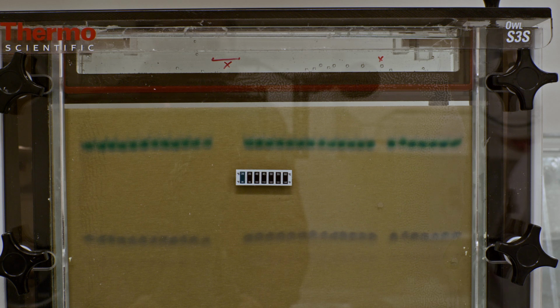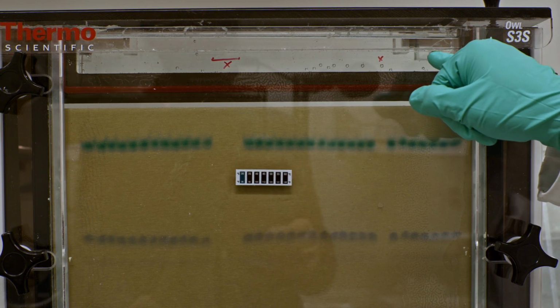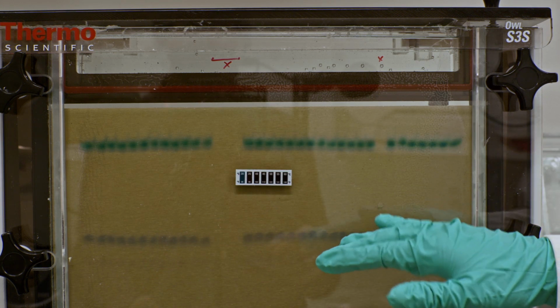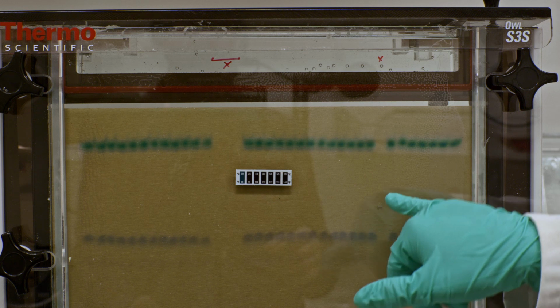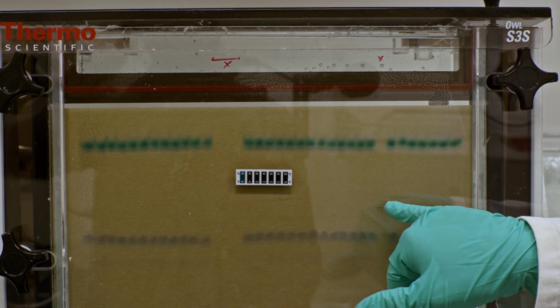Now that 2.5 hours have passed, you can see that the samples that were up here once previously loaded have traveled down the gel. The great thing is that for that one lane where we put an X, you can see that we have missed this bubble that appeared on the gel. Our samples have not penetrated through that.